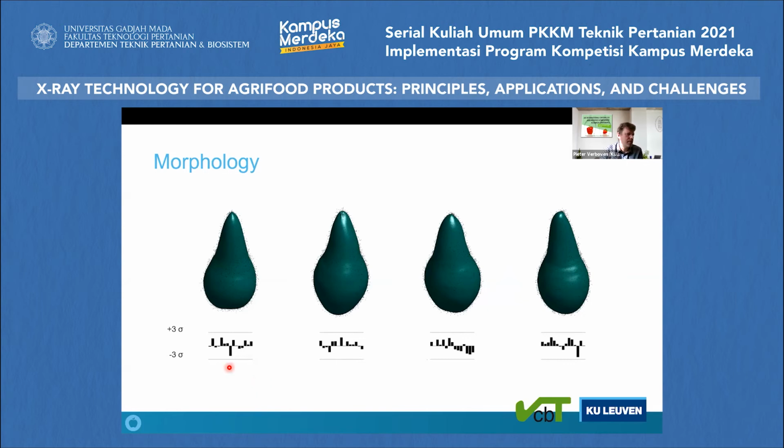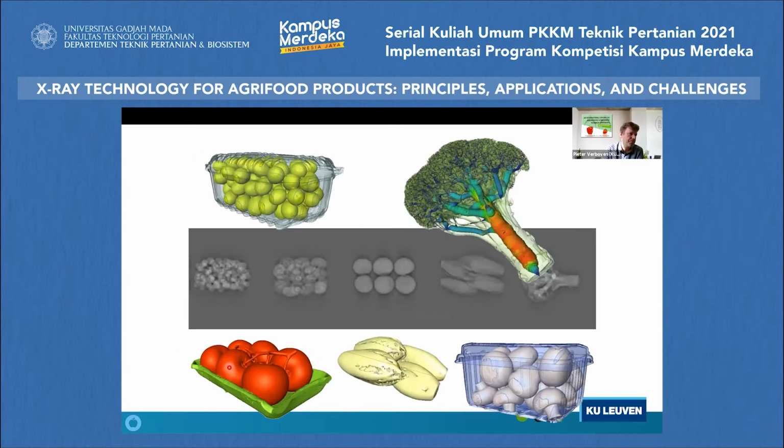In this case, statistical models that can generate these shapes so that we can have an idea about the shape variability of different products. We do this for a lot of applications, not only these fruits like apples and pears, but we do scans also of other products, very often together with partners that are interested in their own applications, and we do the scans for them because they have a certain interest in certain features of the scans, and we can also do the analysis for them.